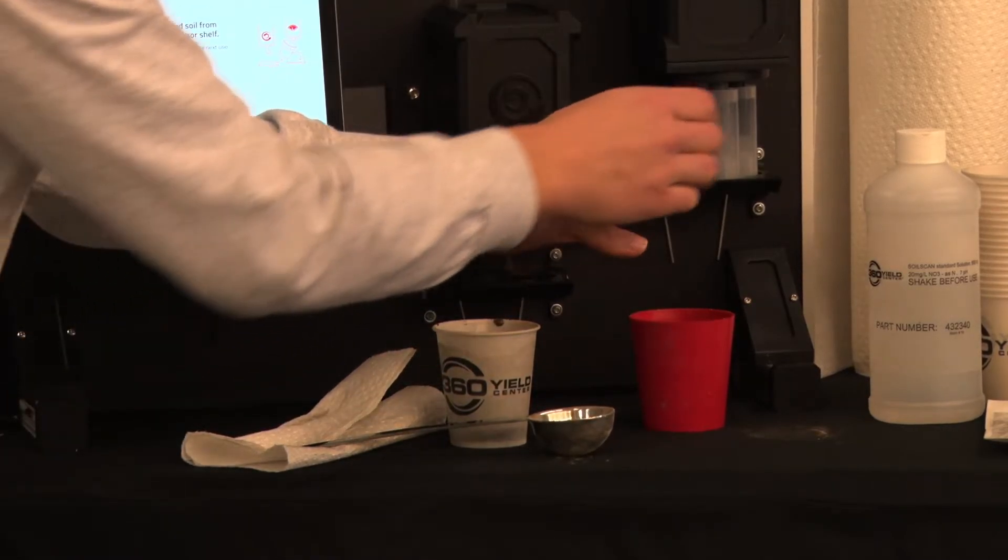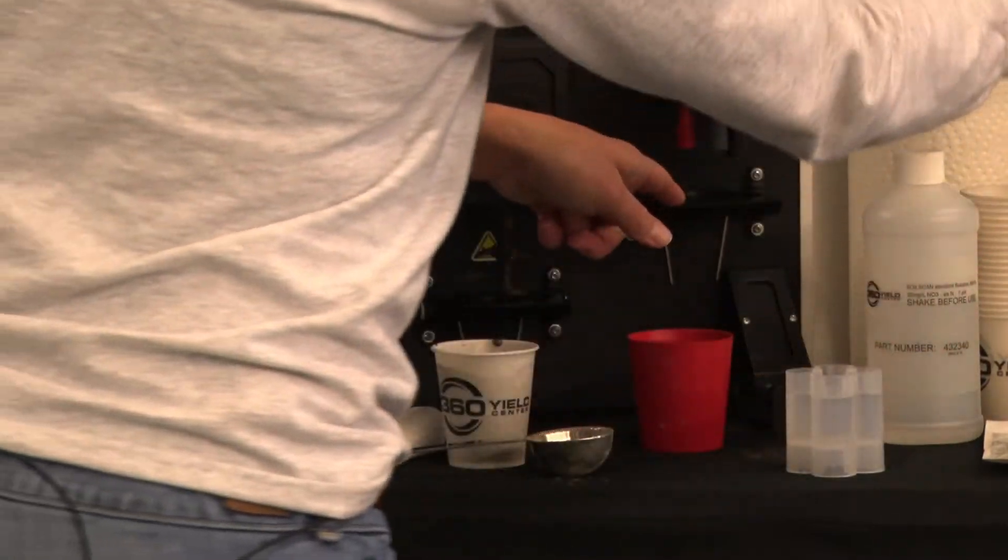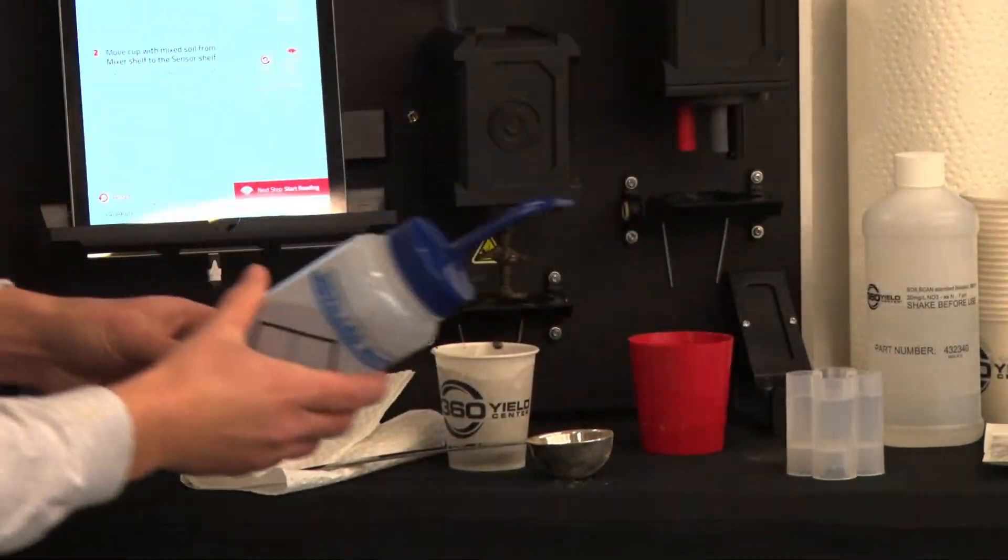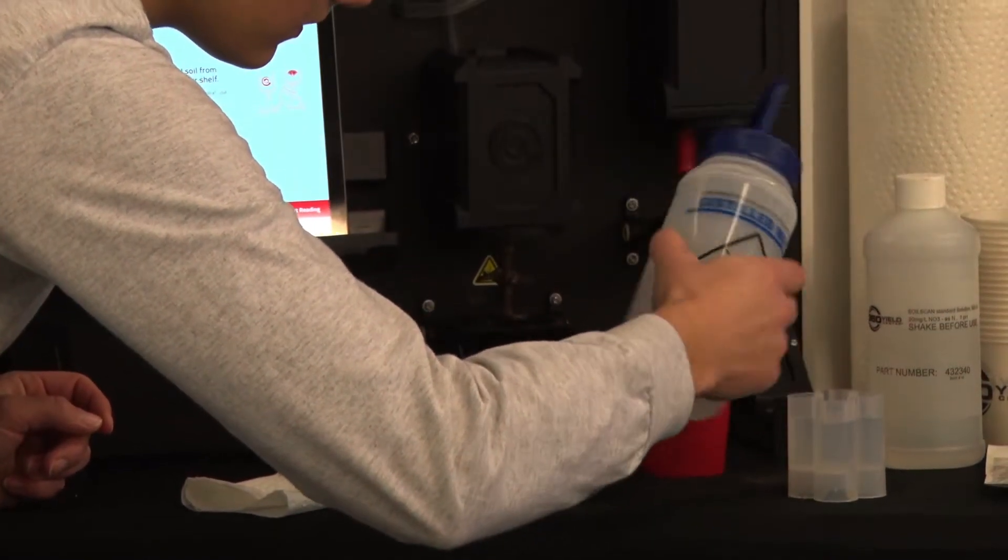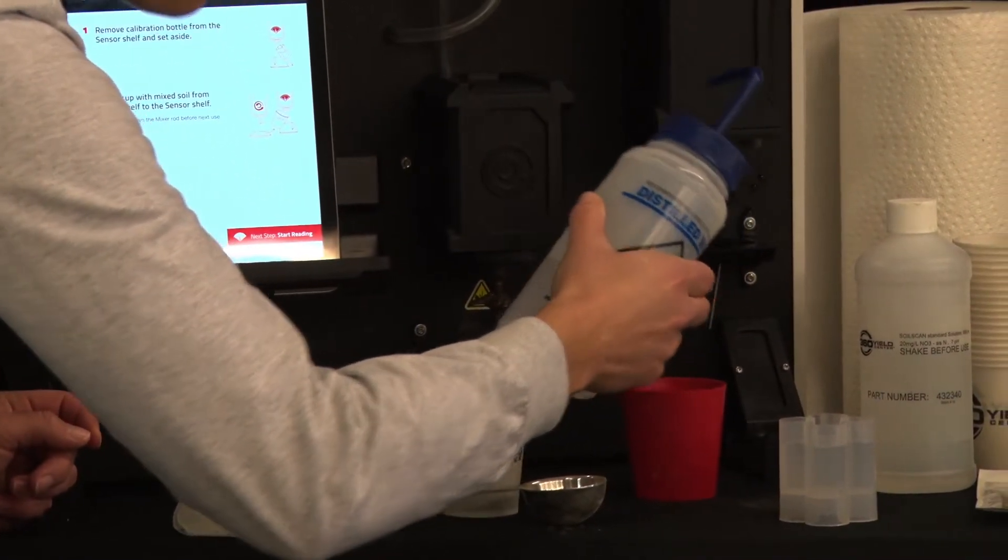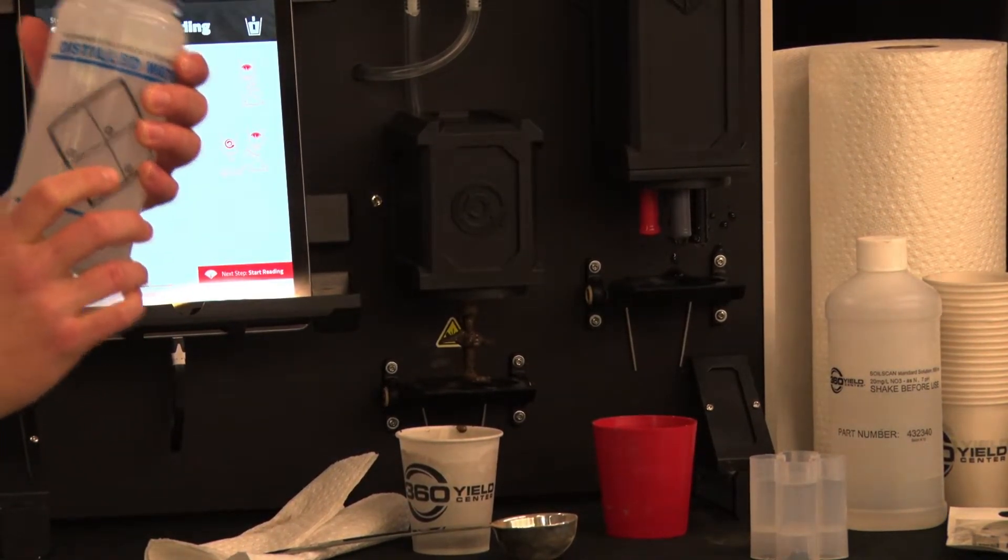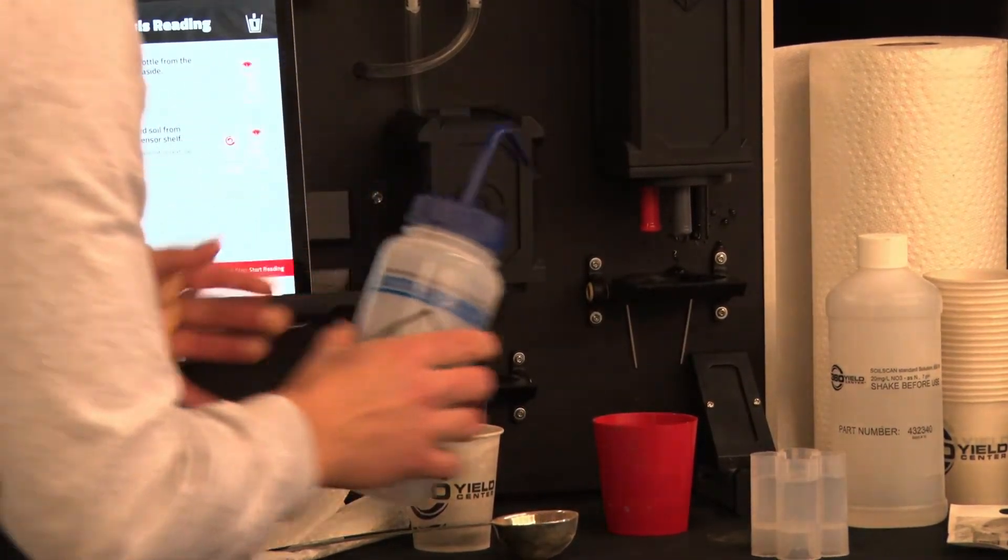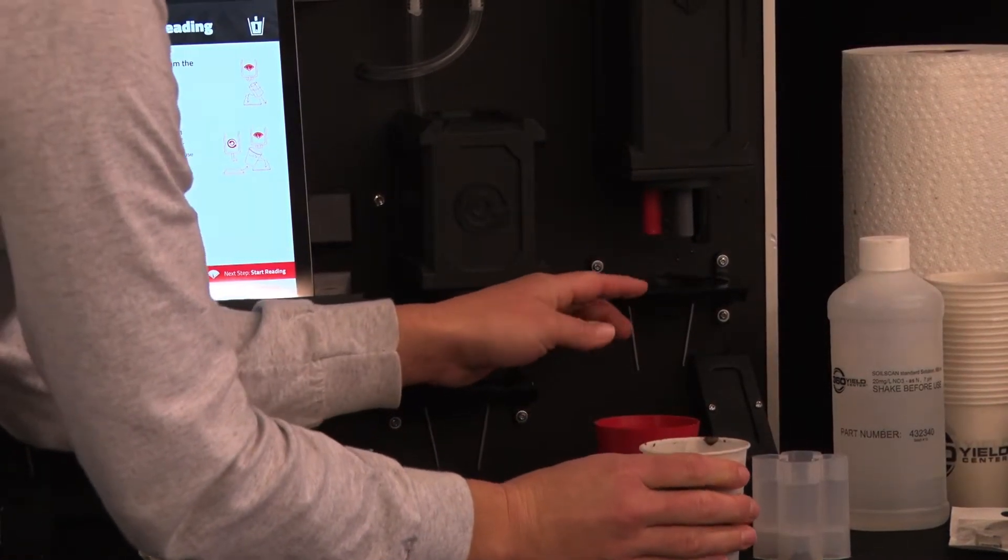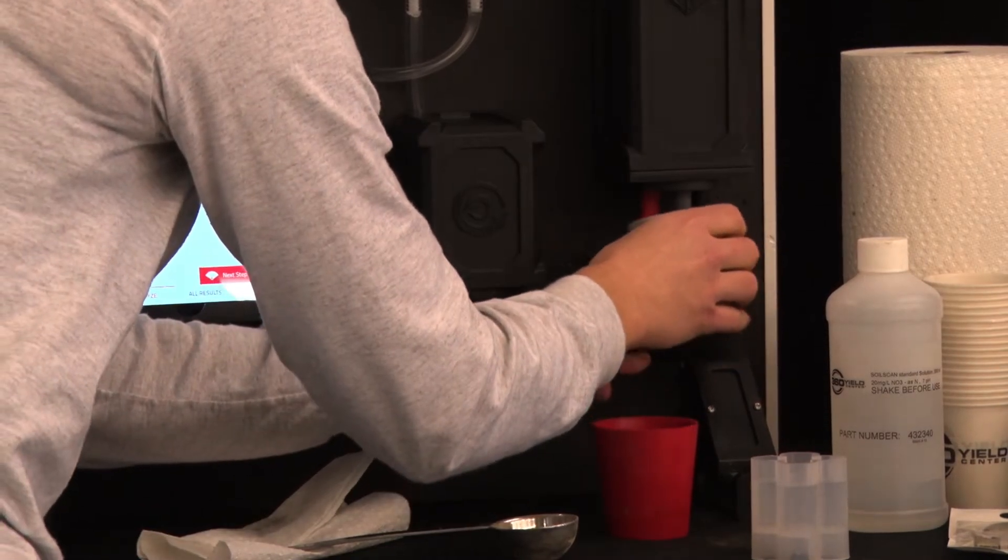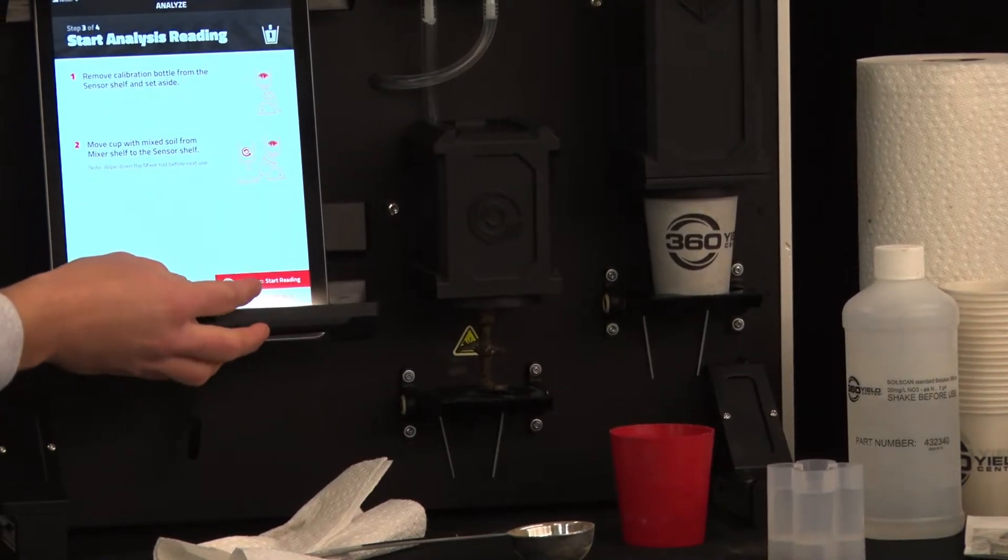Next you'll remove the calibration bottle. And you'll want to spray off the sensors. This is distilled water in the cleaning bottle. You only ever want to use distilled water when cleaning the sensors. After rinsing the sensors off with the distilled water you'll put your slurry mix underneath the sensors. And select start reading.